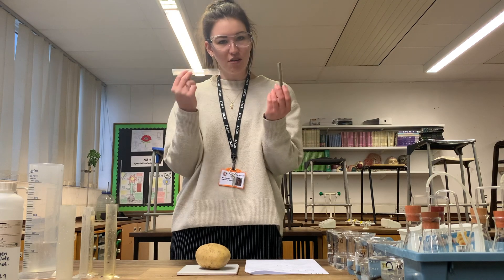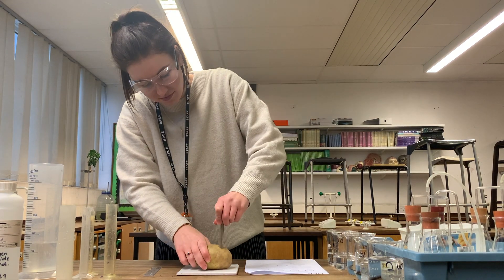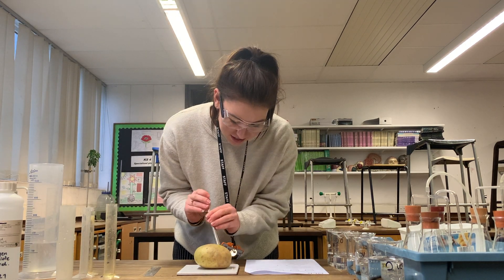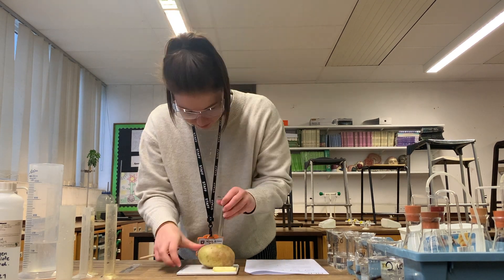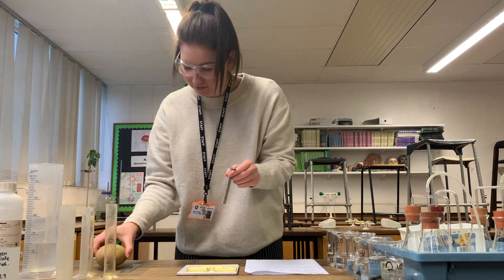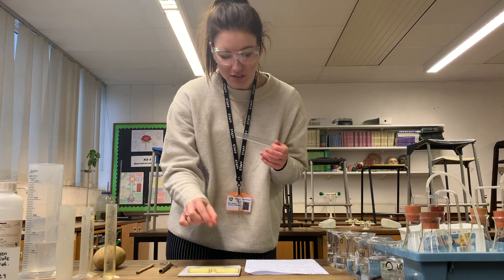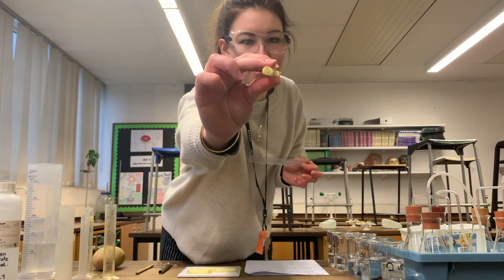I have a cork borer and a ruler. We've got a little rod to get the cylinder of potato out. I need to check they are all 5 centimetres long and carefully remove the skin from each of the edges — you can see on each end there is still the potato skin.